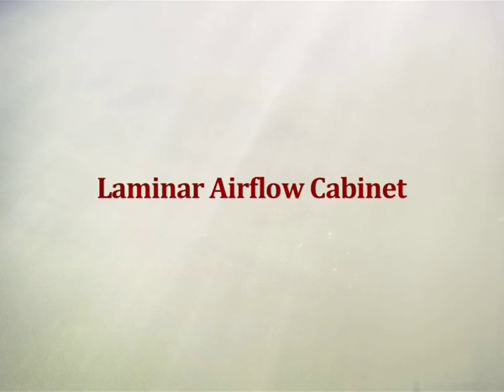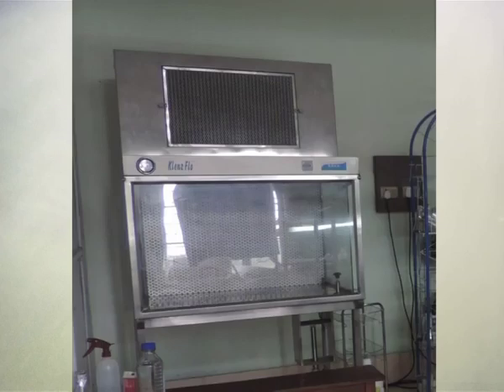The next is the use of laminar airflow cabinet. A laminar airflow cabinet with horizontal airflow from the back to the front and equipped with a Bunsen burner is the primary equipment used for aseptic manipulation.